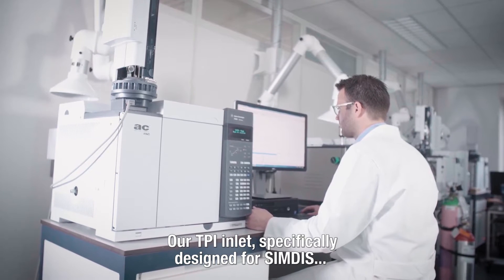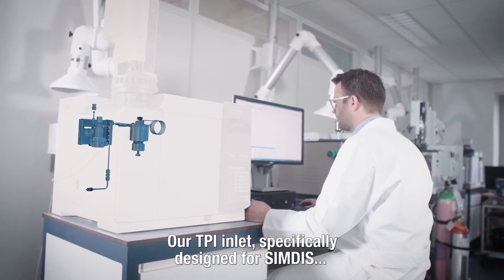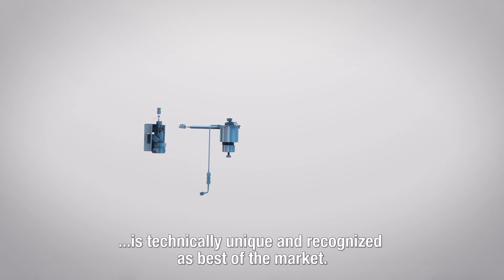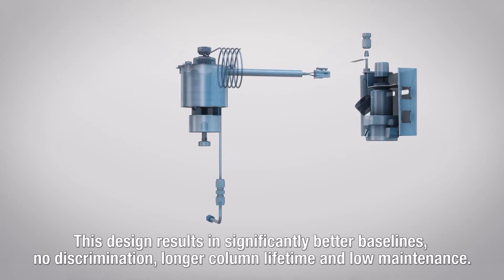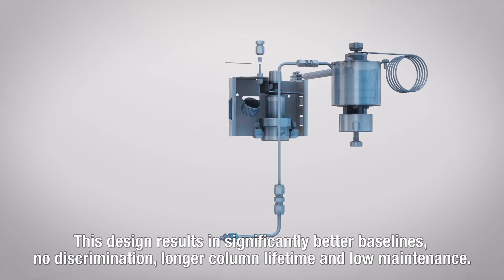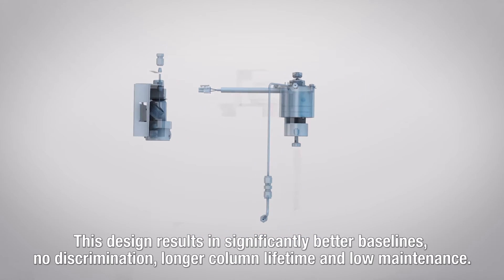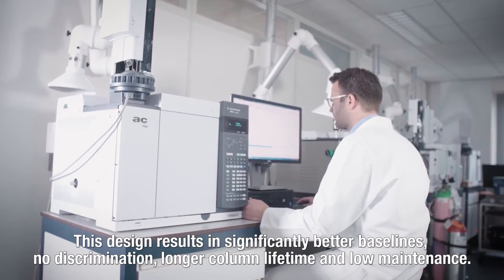RTPI Inlet, specifically designed for SIMDIS, is technically unique and recognized as best of the market. This design results in significantly better baselines, no discrimination, longer column lifetime, and low maintenance.